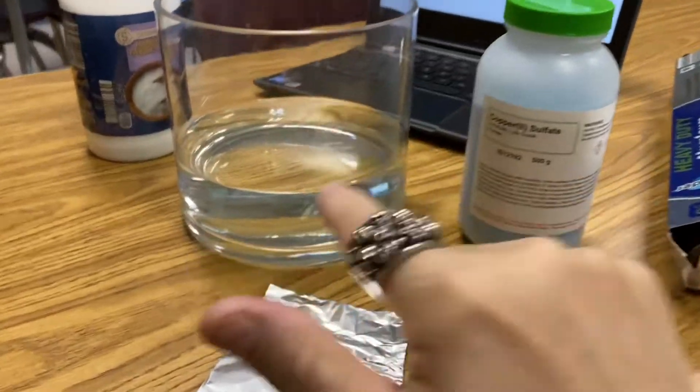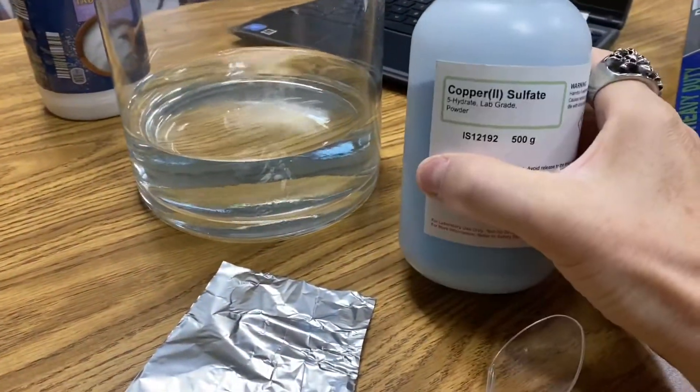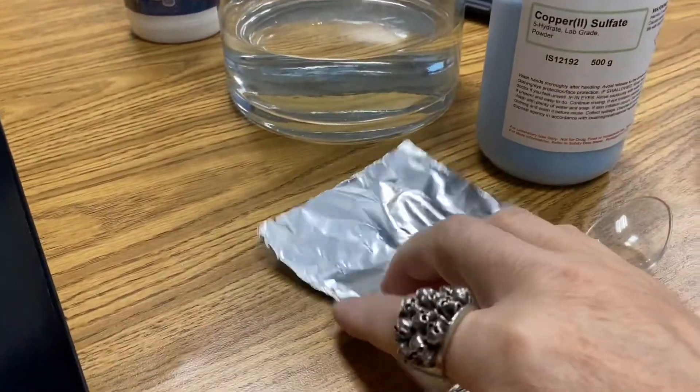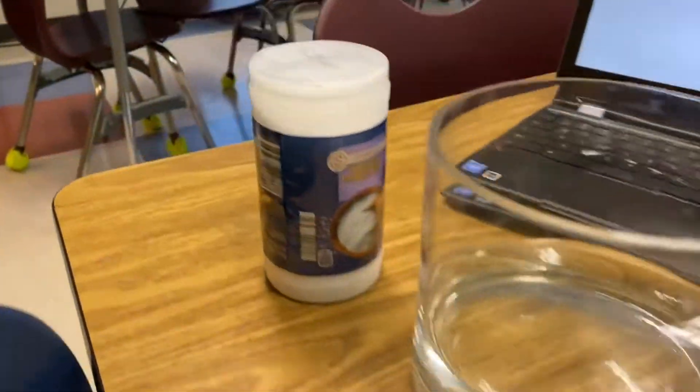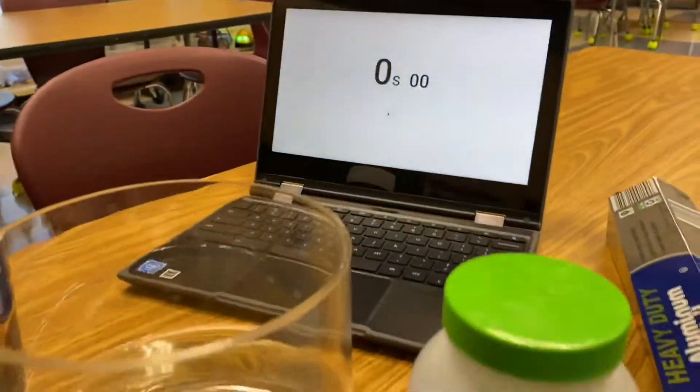All you need for this reaction is some distilled water, your copper 2 sulfate, some aluminum foil, something to stir your copper 2 sulfate in the water with, some salt, and something to keep time with.